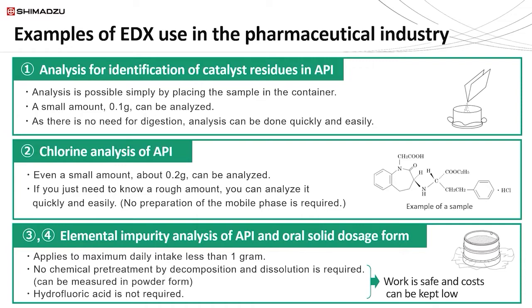The first application is identifying catalyst residues in active pharmaceutical ingredients. The next application I actually think is pretty cool. It's pretty interesting. I don't want to call it novel, but I'll show it later, of course. It's chlorine and chloride analysis in API.